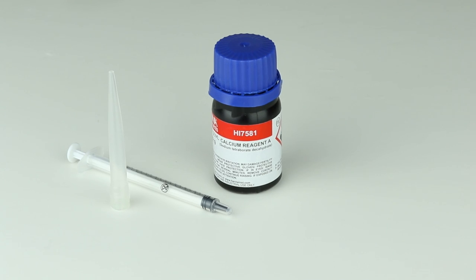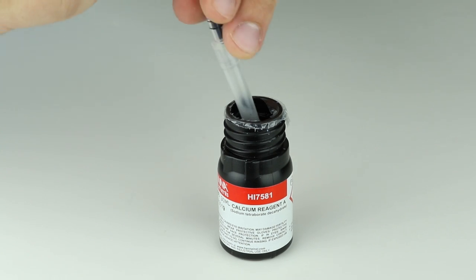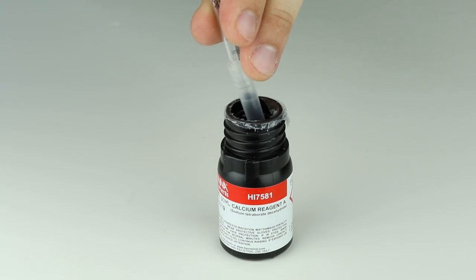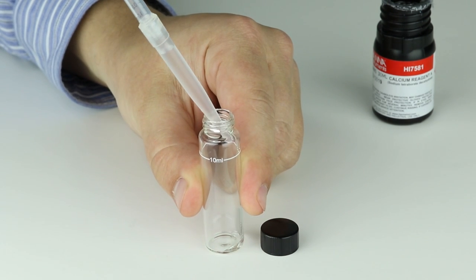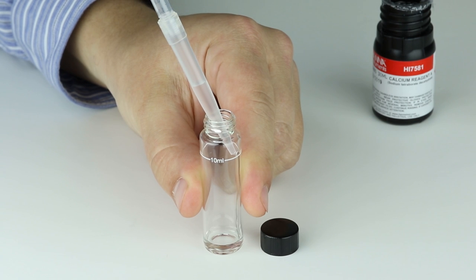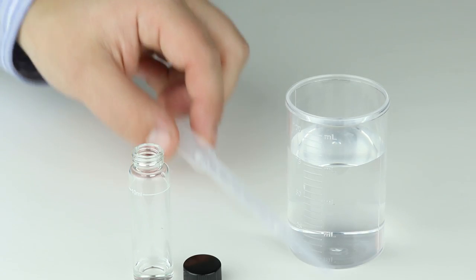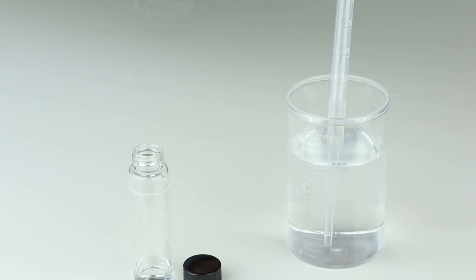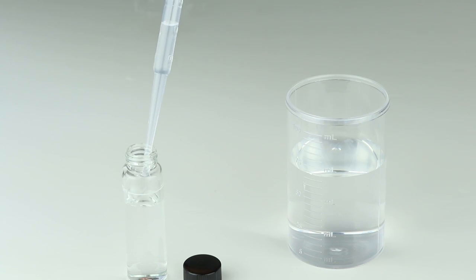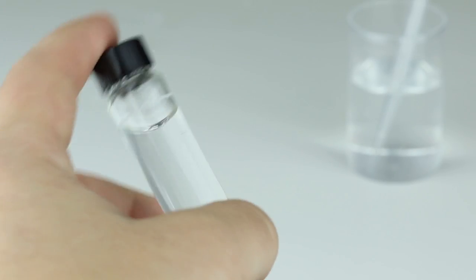Using the 1 mil syringe, add 1 mil of reagent A to the cuvette. Then, using the dropper, fill the cuvette to the 10 mil mark with deionized or distilled water. Once the reagent and water are added, invert the cuvette five times to mix.